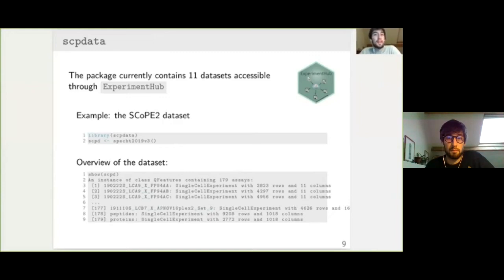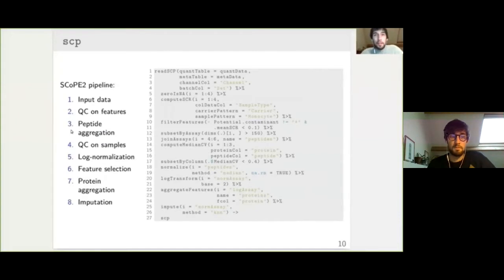Now the idea is, from the PSM data, to try to reconstruct this peptide and this protein dataset. This was already done by SCoPE2 and provided by the authors, but it might be interesting to test our tools and do this by ourselves. And so here is what is shown.